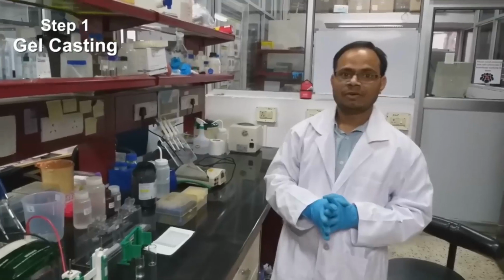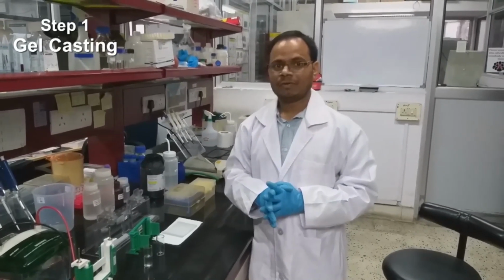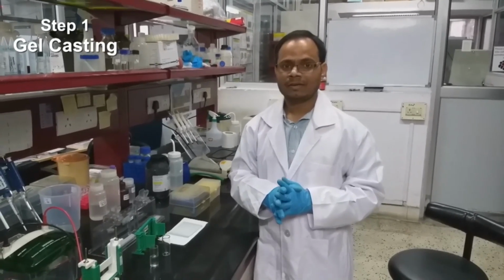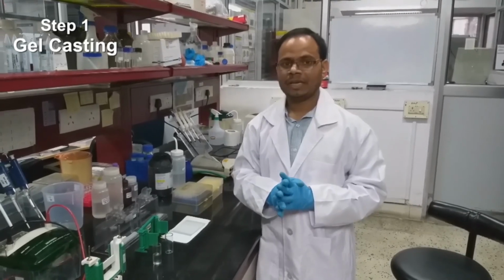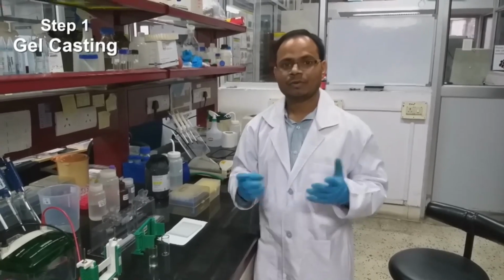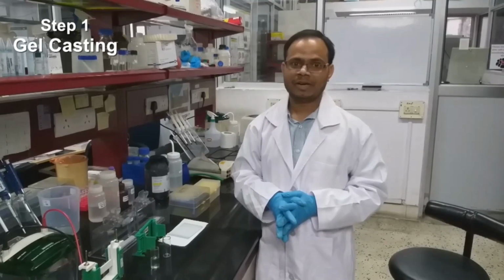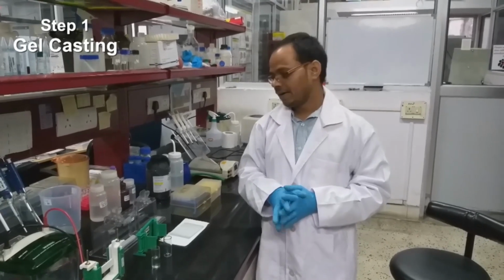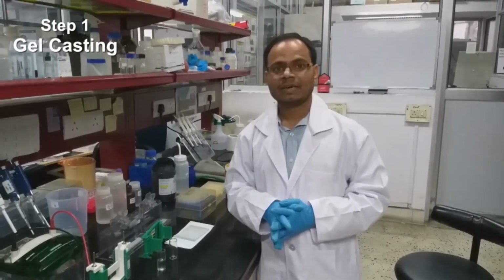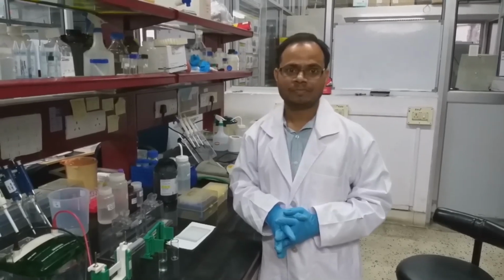After this, we have to prepare resolving gel. For resolving gel, we need 1.5 molar Tris HCl, pH 8.8. In addition to that, we also need 10% SDS prepared in double distilled water, and also 10% ammonium persulfate and also TEMED.